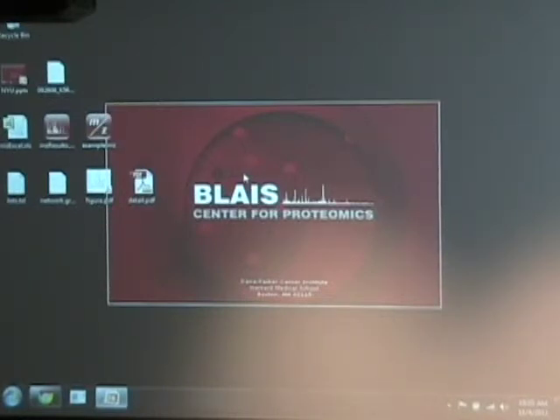So if a mass spec lab would want to install MZ server, how much of a commitment is that? Is it really easy, or do you have to work on it for weeks?